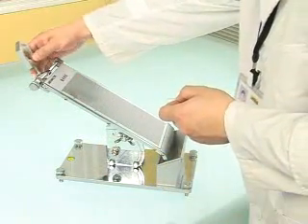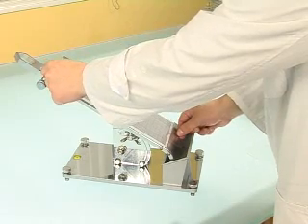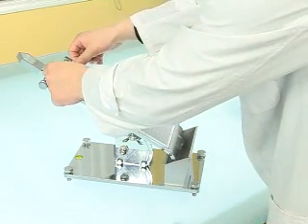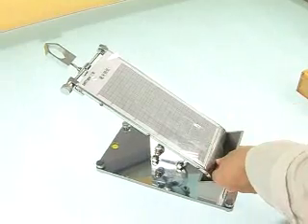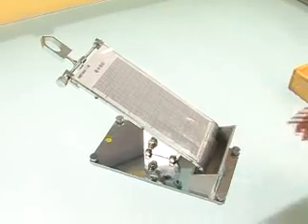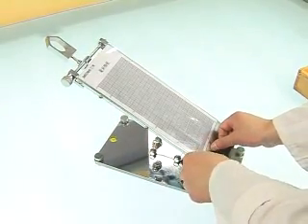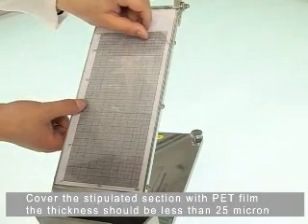Fix the sample. Cover the stipulated section with PET film. The thickness should be less than 25 µm.